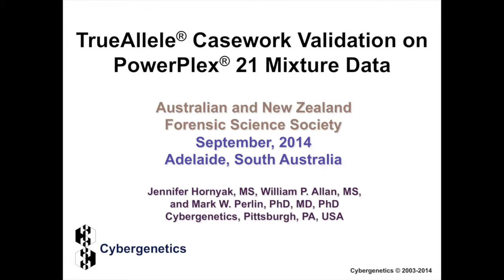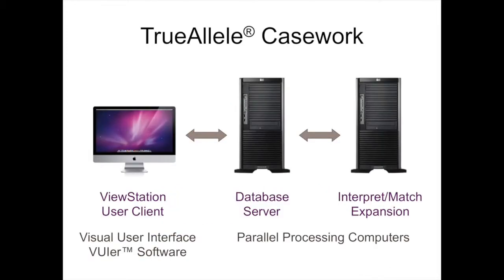Today I will be talking about a TrueAllele Casework validation study on PowerPlex 21 mixture data. TrueAllele Casework is a computer system developed by Cybergenetics that is used to interpret DNA mixtures. The system uses hierarchical Bayesian probability modeling and Markov chain Monte Carlo statistical sampling in order to solve for the genotypes in a DNA mixture problem. The system is designed to have a very interactive as well as efficient analyst workflow.